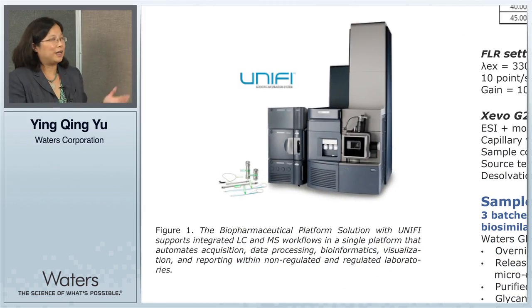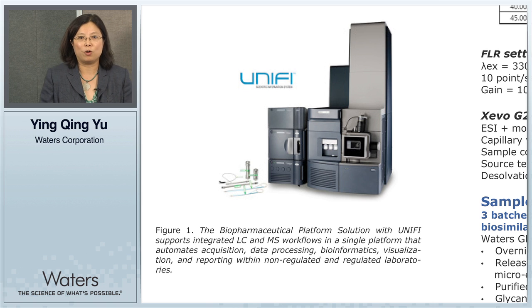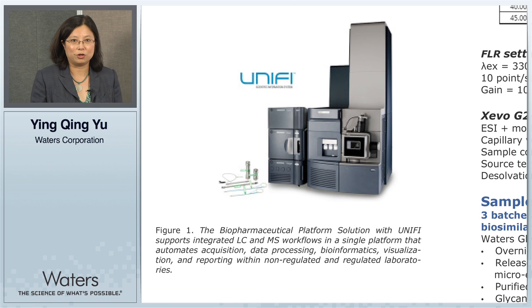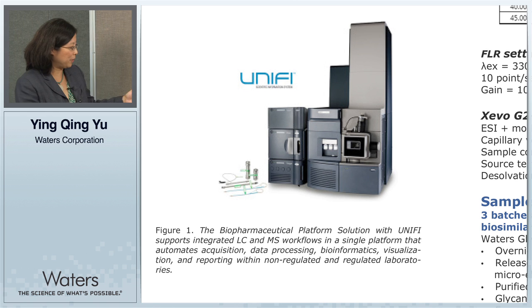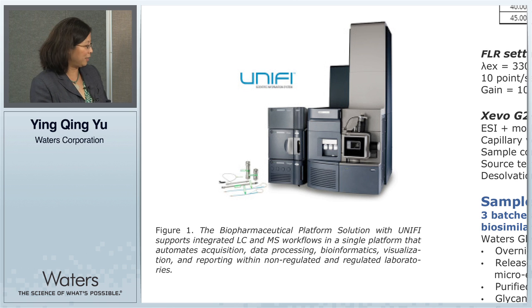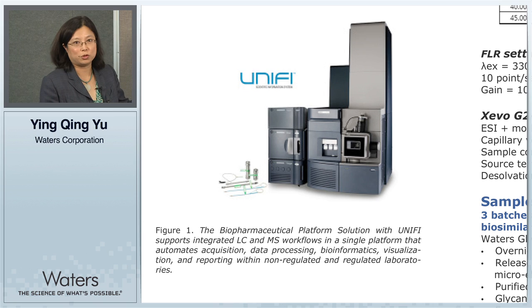For this study, we are using this analytical platform from Waters called the Biopharmaceutical Platform with UNIFI version 1.7, comprised of an H-Class Bio system with fluorescence and the Xevo G2 QTof MS detectors. Here's a picture of what the system looks like. It's got an LC-MS fluorescence detector and also consumables to go with it.